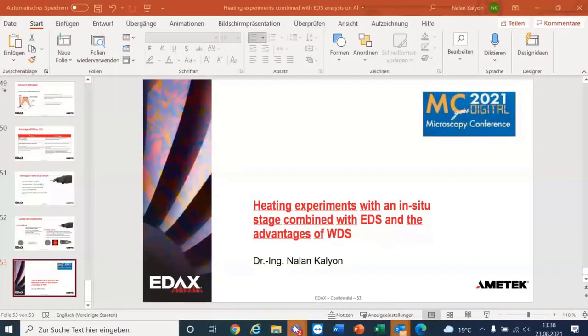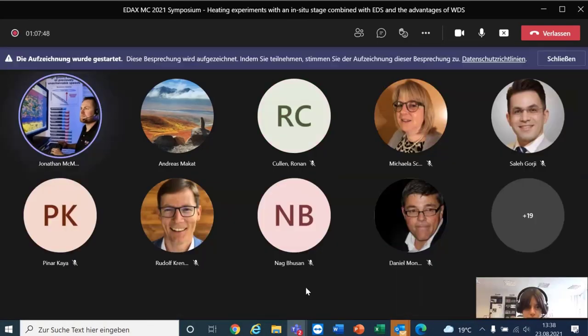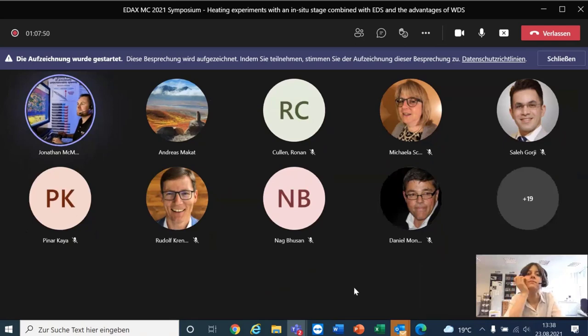Nalan, we have one question in the chat asking, what is the lateral resolution of the tool? And I'm not sure if that was referring to the Murano or the Octane Elite.